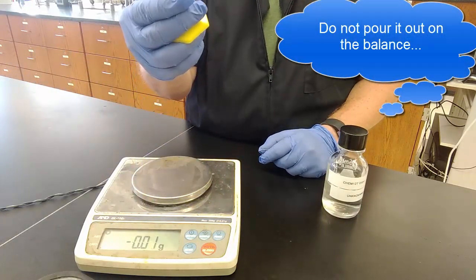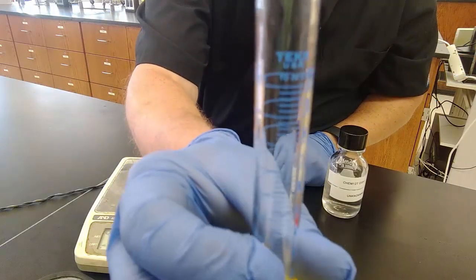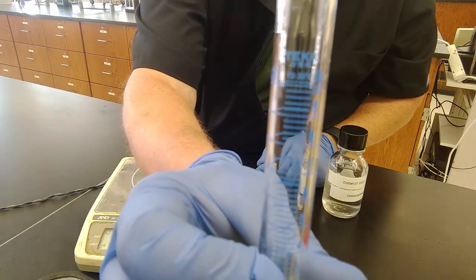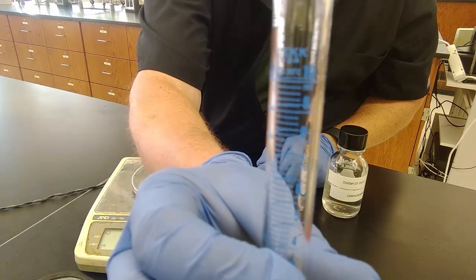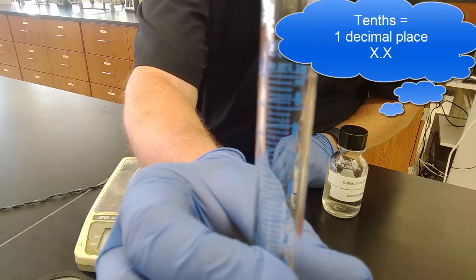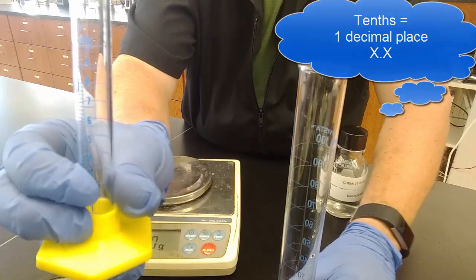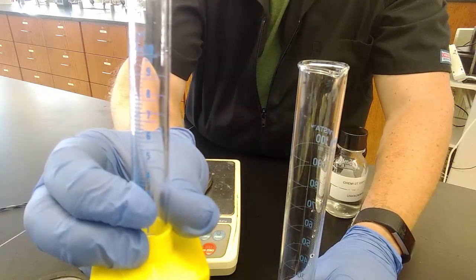Now, why am I saying 00 on this one? Well, if you look really closely, this graduated cylinder is marked in tenths. Actually, it's marked in 2/10, which is a little bit annoying, but it's marked in tenths. The 100 milliliter graduated cylinder was marked in ones, and so we guessed, is it between 61 and 62?